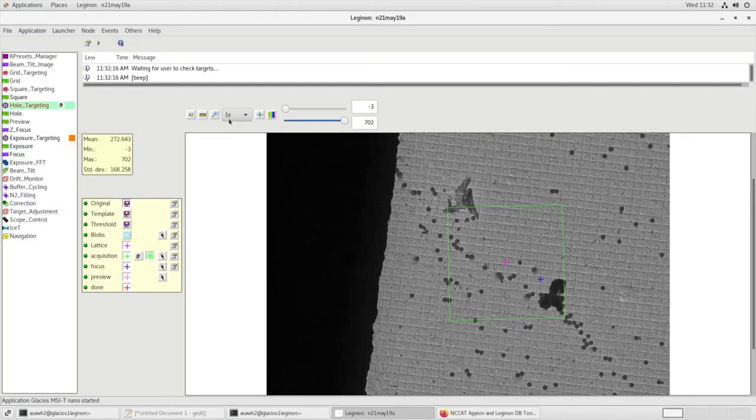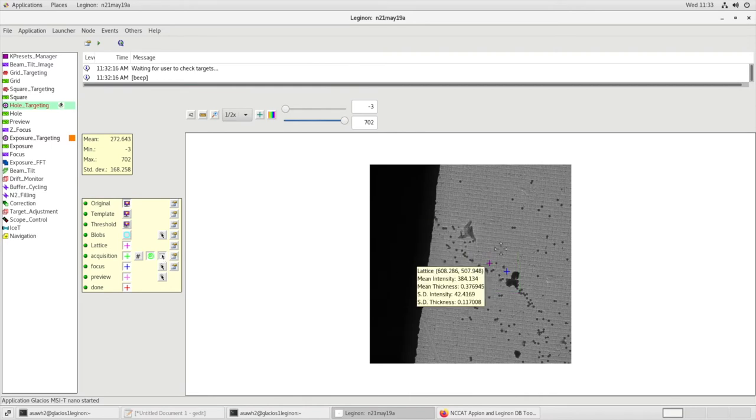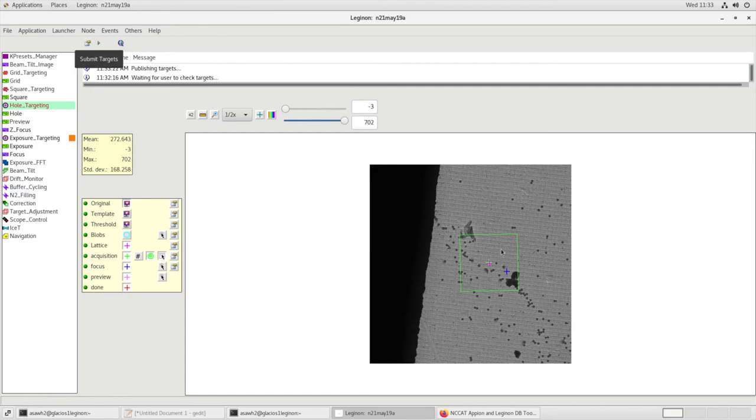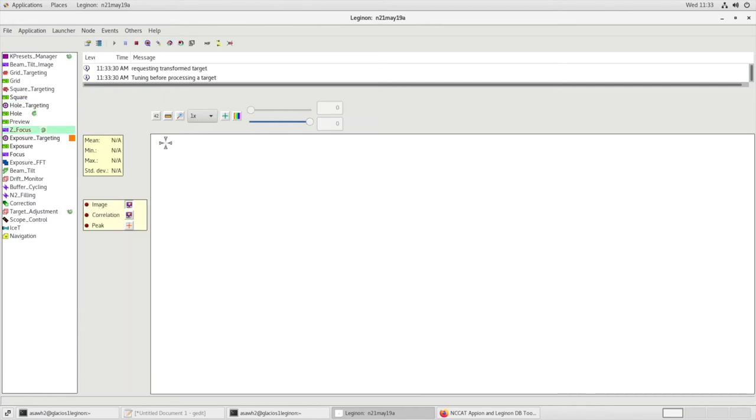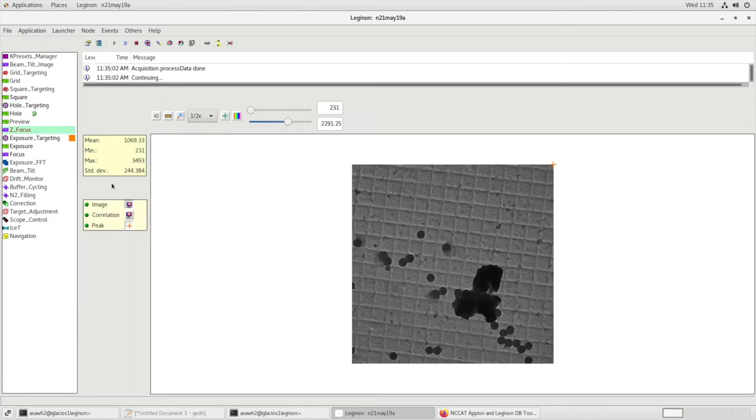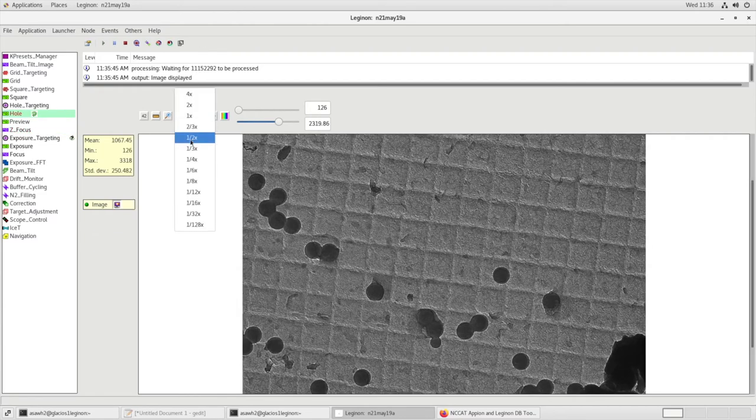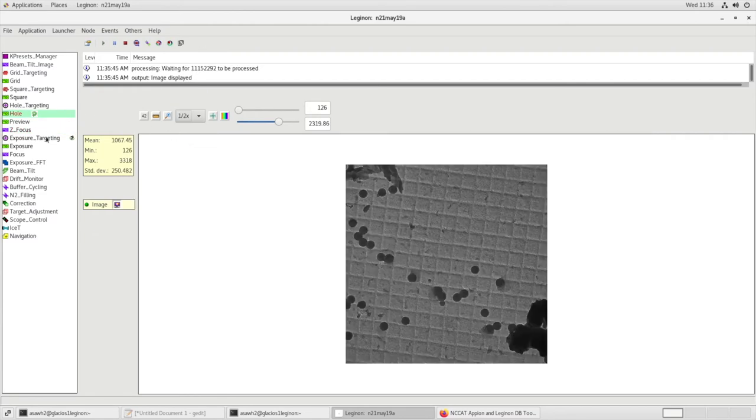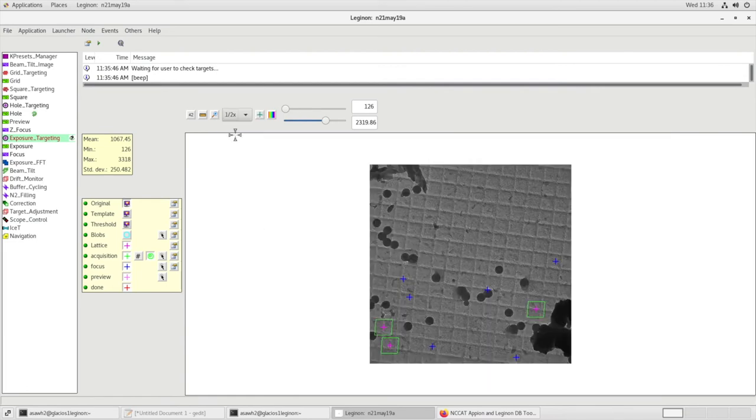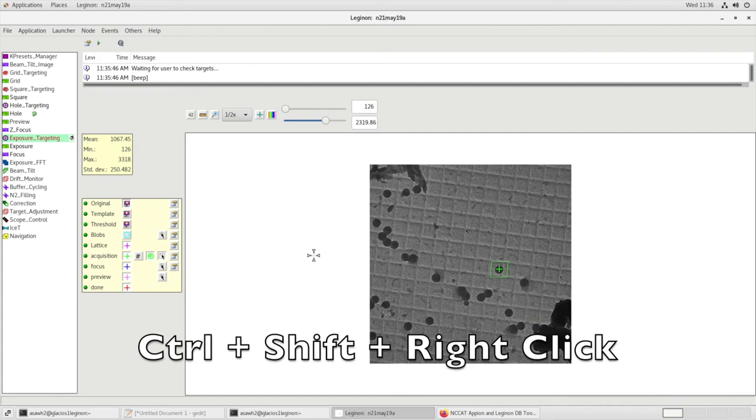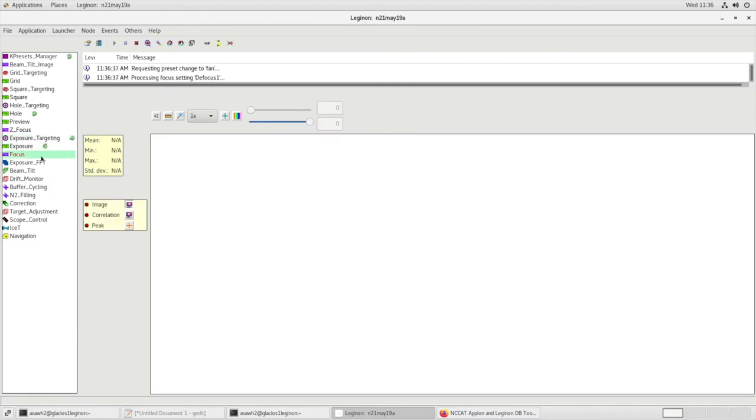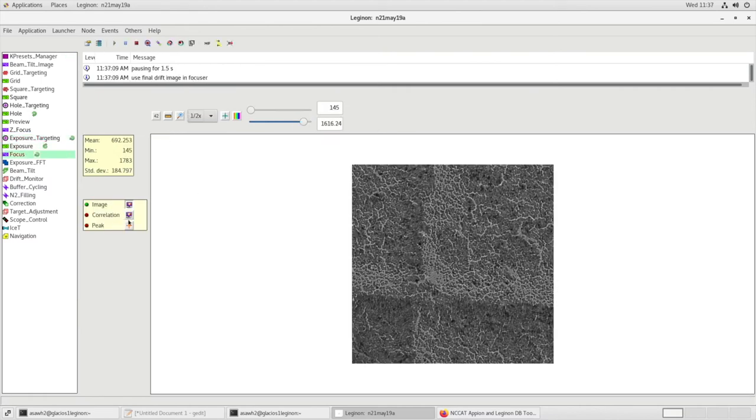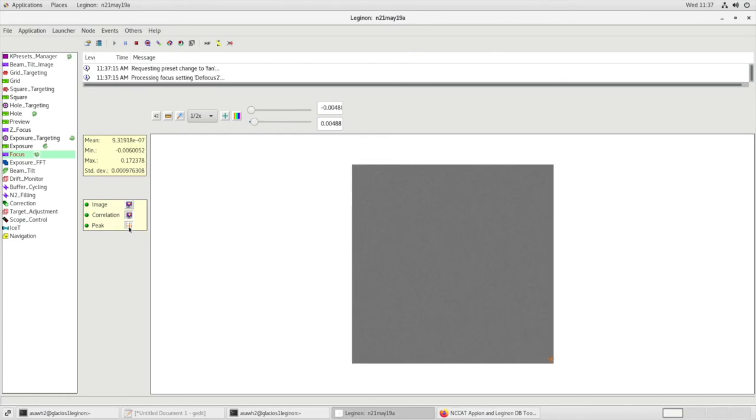In Hole Targeting Node, if there's already an Acquisition and Focus Target, we can remove it by right-clicking on it and replacing it where we need. Now let's Submit Targets and also Submit the Queue. Now let's go to Z Focus. Make sure that we're at Eucentric Height. In Hole, we'll see our image. In Exposure Targeting, if there are already targets, we can remove them by selecting Acquisition Targets, Control-Shift-Right-Click, and place the targets that we actually would like. Don't forget a Focus Target and Submit. Let's go to Focus Node. Let's make sure that we're at Eucentric Focus by playing with Peak and Correlation. Make sure the peak is in the corner.